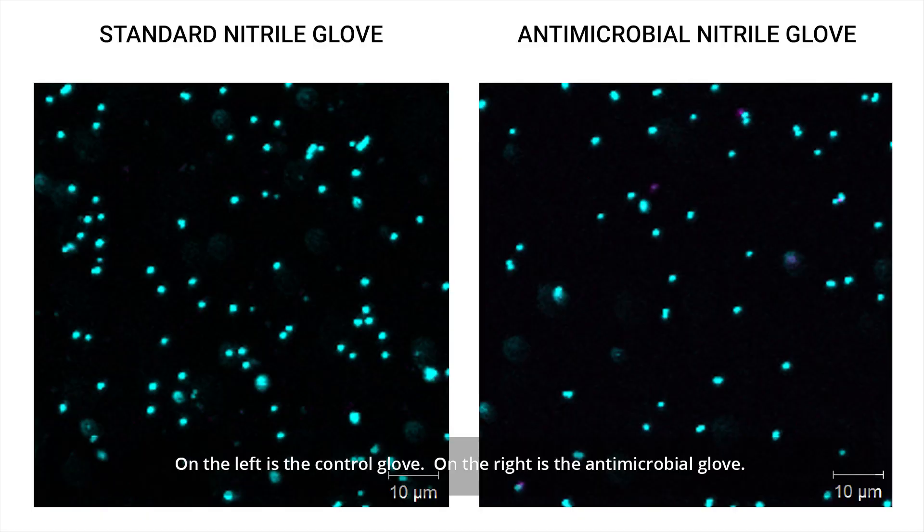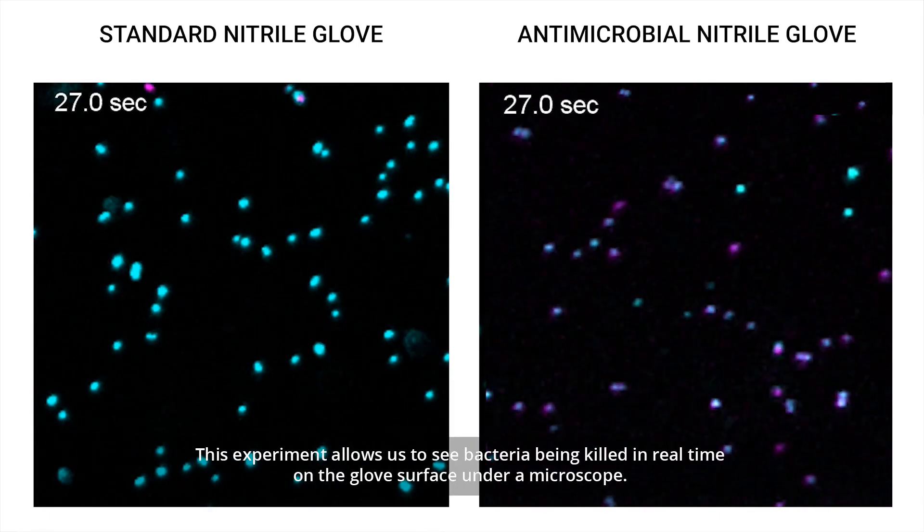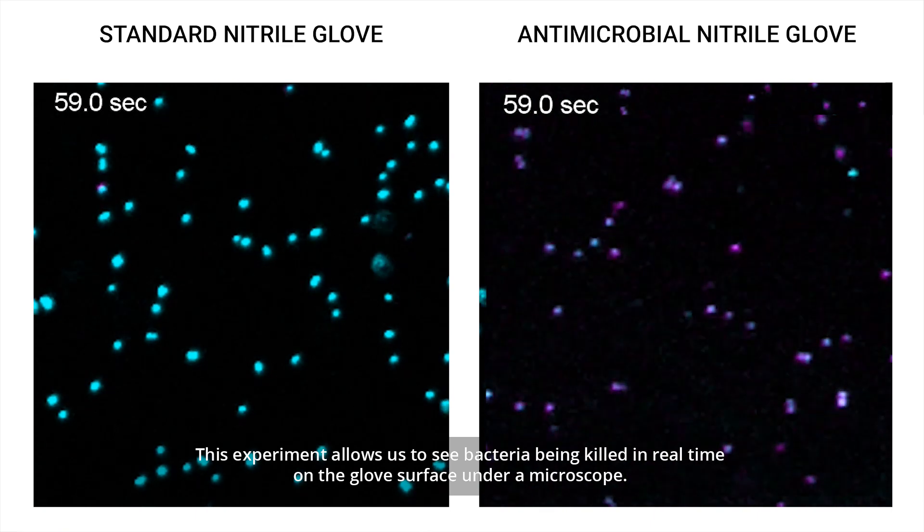On the left is the control glove, on the right is the antimicrobial glove. This experiment allows us to see bacteria being killed in real time on the glove's surface under a microscope.